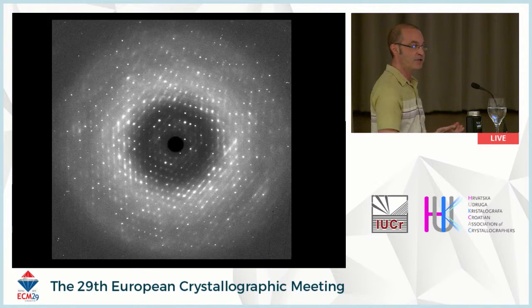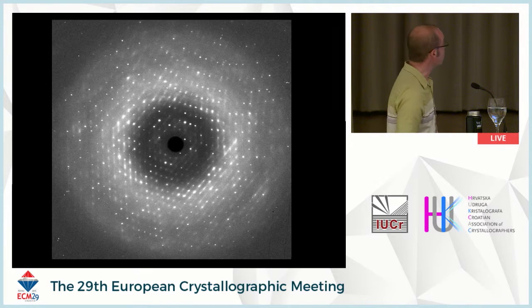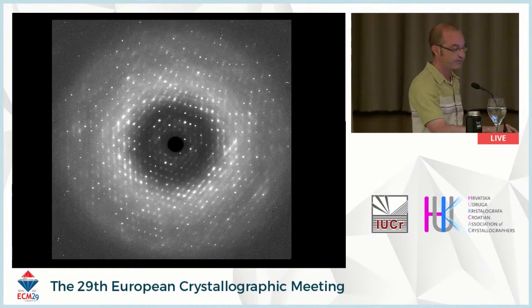This is related to the variational scattering that was already mentioned in Lois's talk. In addition, we have streaked features, which we can see that protein crystal diffraction patterns often have. And this is related to thermal diffuse scattering or vibrations or maybe other types of disorder in the protein crystal. And then finally, there are these cloudy features as well that you can detect, which may be on length scales in reciprocal space that are several Bragg peaks or at least larger than the distance between the Bragg peaks, but yet smaller scale than this ring. And so that's also related to the variational scattering.